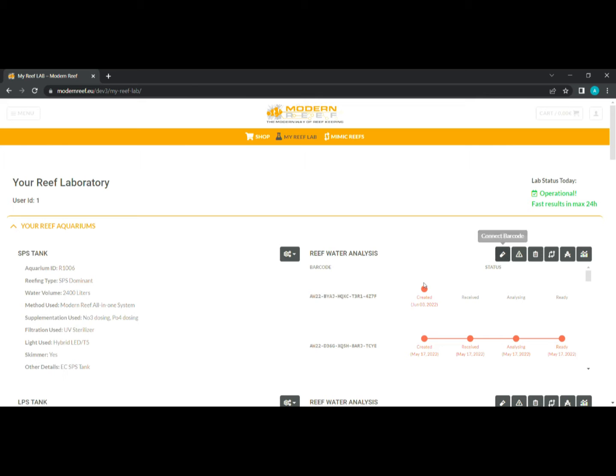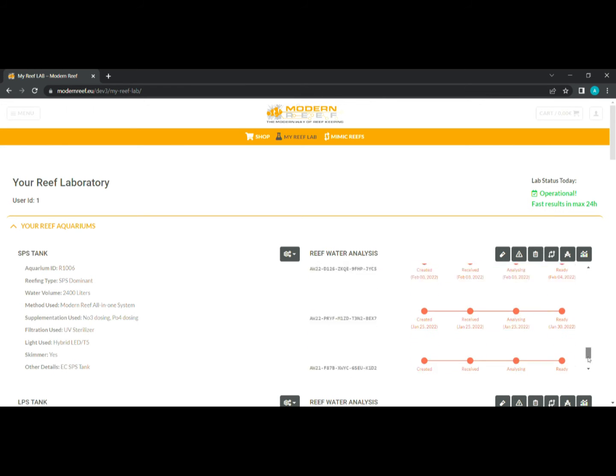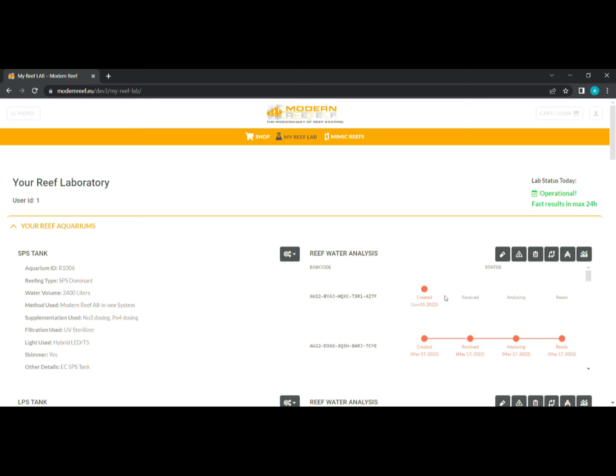Now here you have the analysis made, all the analysis connected. This would be the last one. You would see it created like that. Once we receive it, it's orange in here, analyzing and ready.